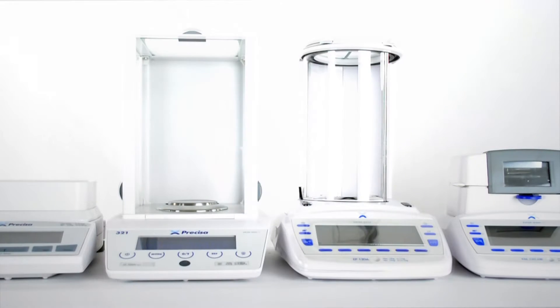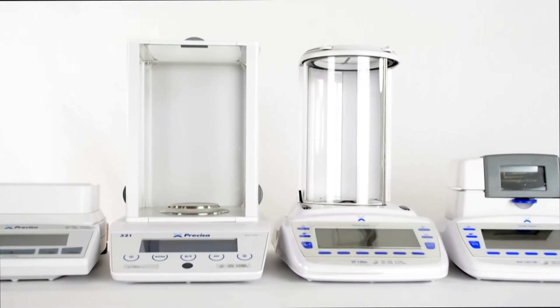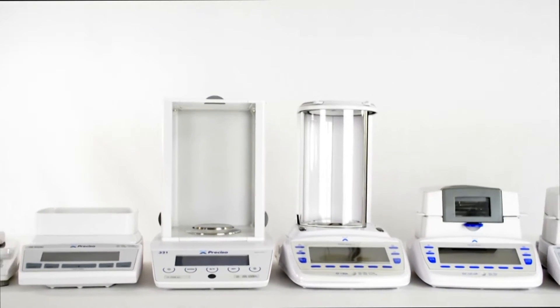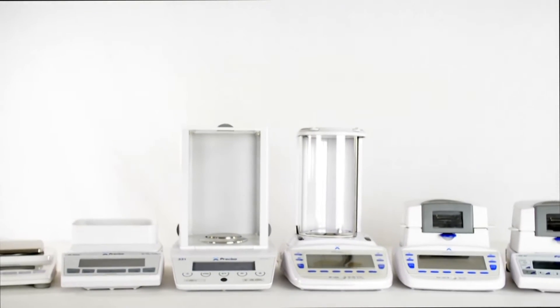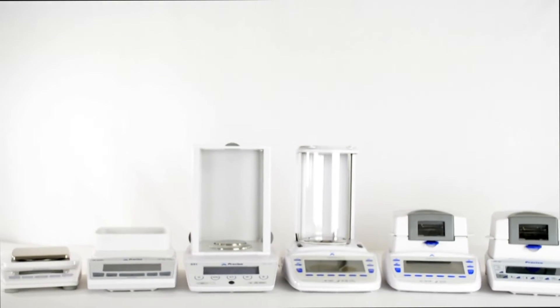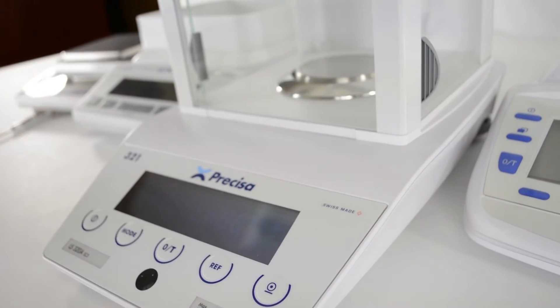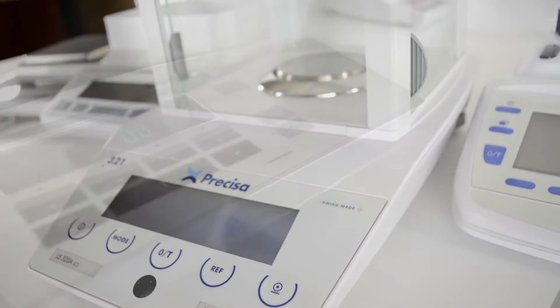For more than 70 years, Swiss engineers at Precisa Gravimetrics AG have been honing their craft to produce a balance range like no other.